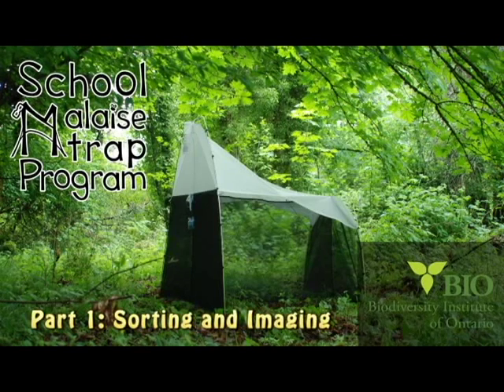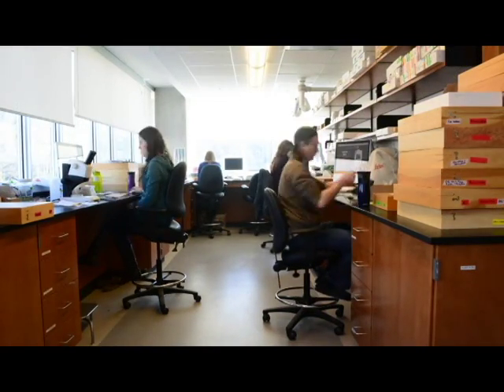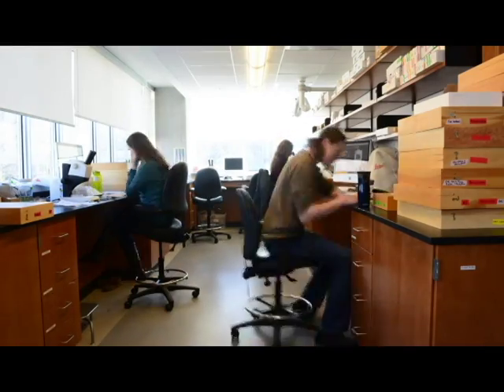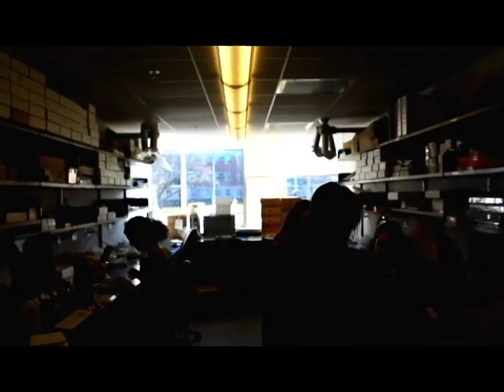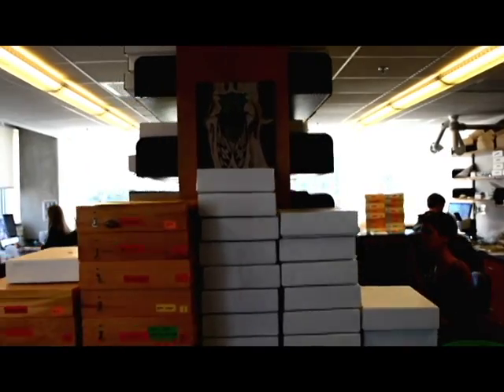Welcome to the first in a series of videos in which we want to show you step by step what will happen to the insects you collected for the School Malaise Trap program. Once your package arrived here at the Biodiversity Institute of Ontario, your collecting bottles will be passed on to our collections group for sorting and imaging.